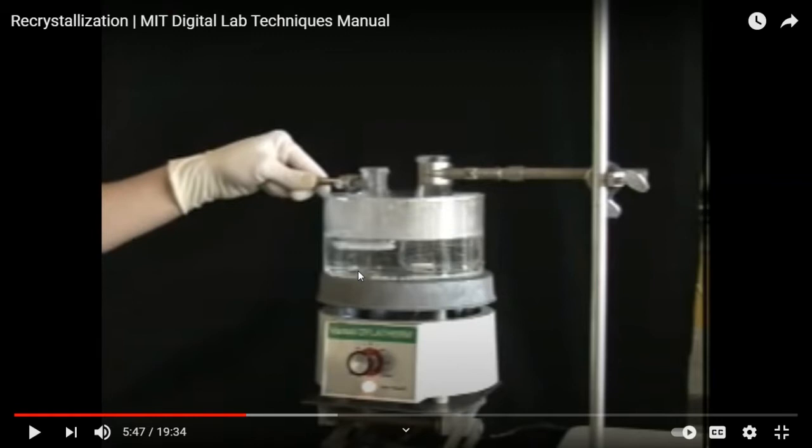You notice as you add one pipette full of a hot liquid to the mixture of solid, you actually see some amount of solid disappear because you have more liquid that's boiling. And that's your choice, right? You keep adding and you have to check. It keeps disappearing, but at some point you add it, and it looks like it doesn't disappear. You add more, I still have a solid. And I still have a solid.